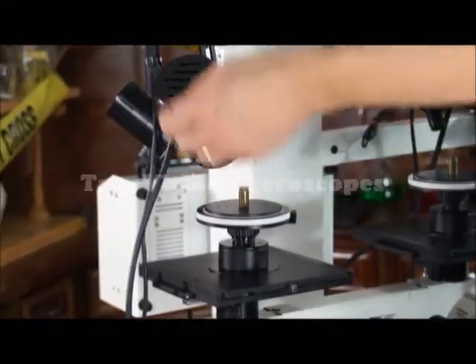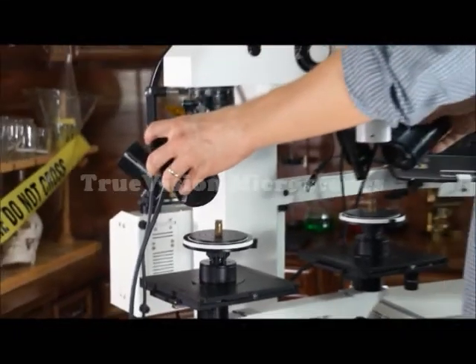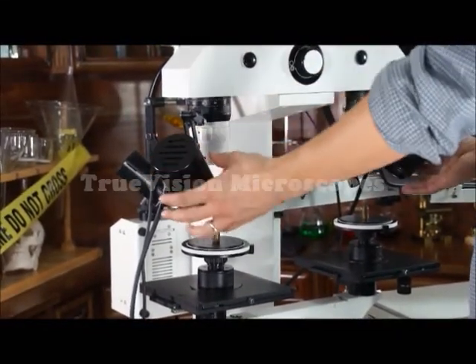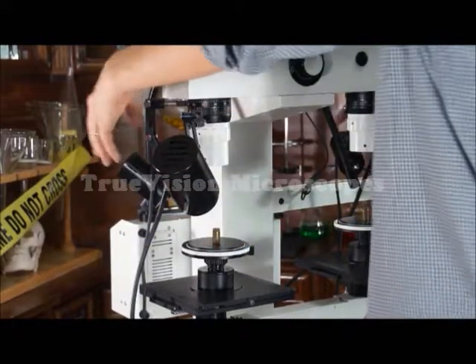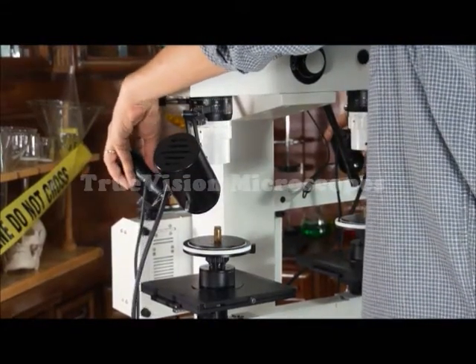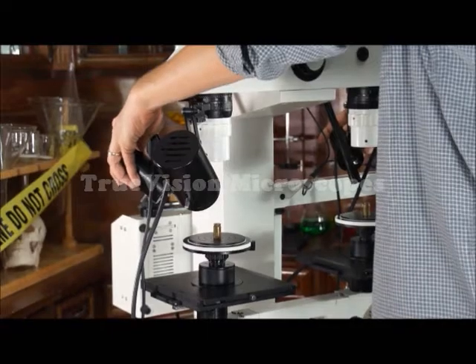Then we have LED illumination. This is a 4 band LED illuminator. This is a typical 5 watt cold LED light source.